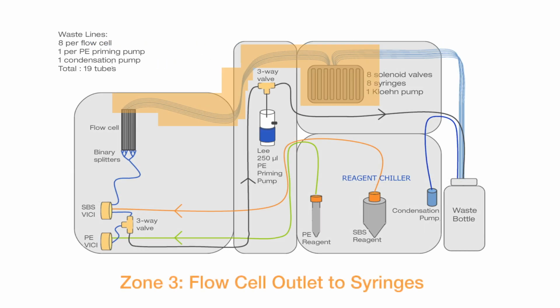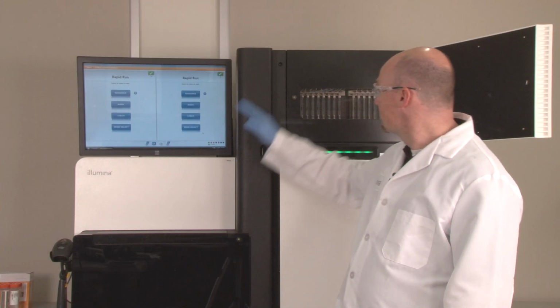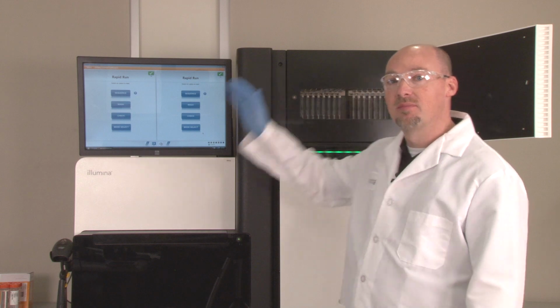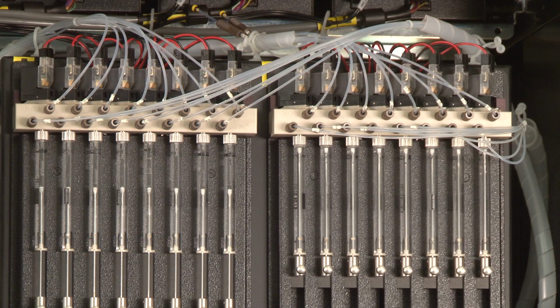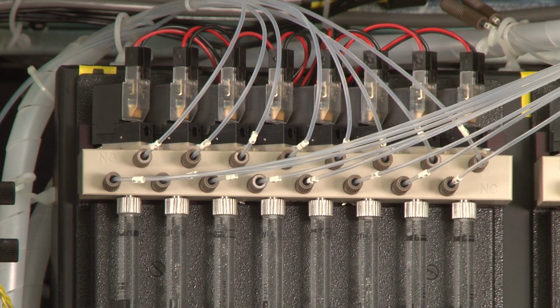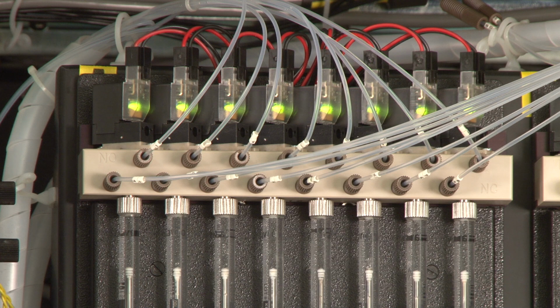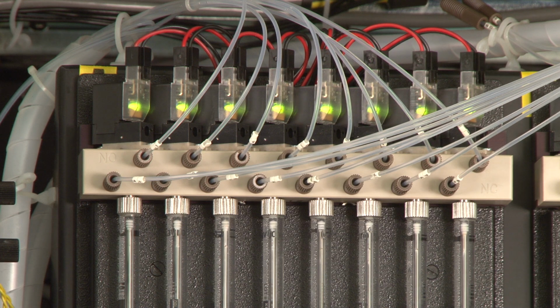If the clog is in a single lane and there is backflow associated with it, then it is likely that the blockage is from the back of the flow cell to the syringe pumps. Monitor the syringe associated with the block while pumping and check for large air gaps. If air gaps are seen, perform an instrument wash to push the air to waste gradually. Ensure that the solenoid valves atop the syringe pumps are functioning properly when they switch positions. The solenoid should click and change LED indicators when working properly.